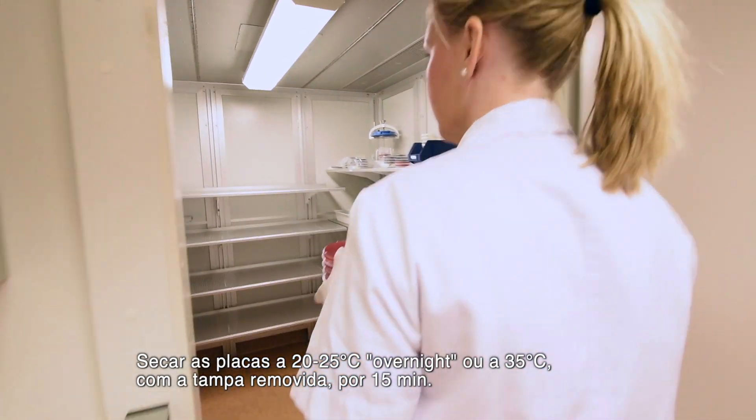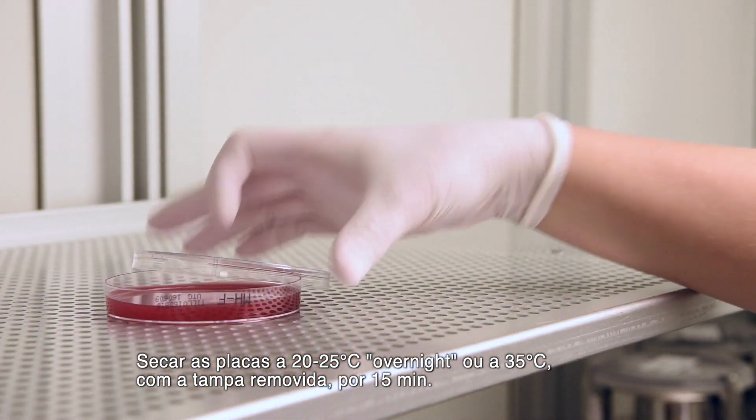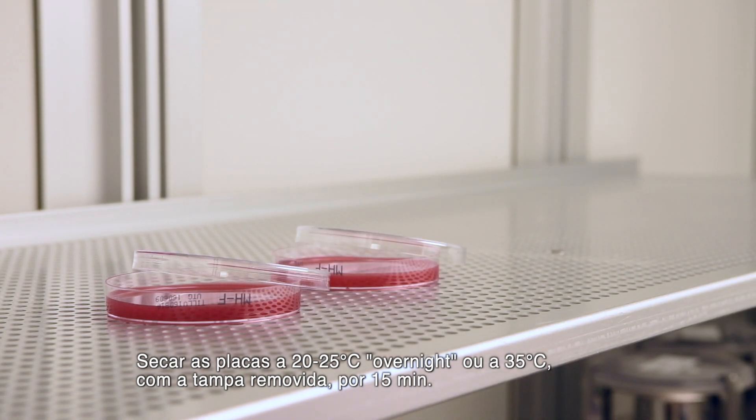Dry plates either at 20-25°C overnight or at 35°C with the lid removed for 15 minutes.